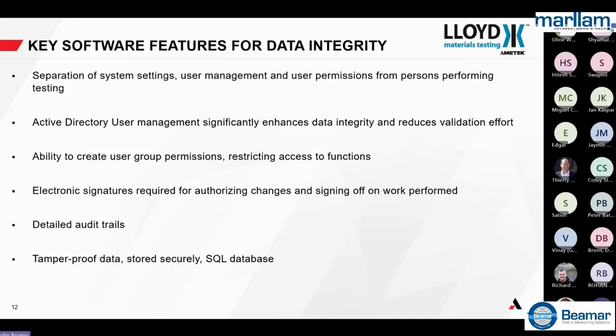The next one is to identify the user. We actually use Active Directory user management. Active Directory is basically your Windows login, your corporate Windows login. And by using that, we can be sure that only you signed in and signed off on work.